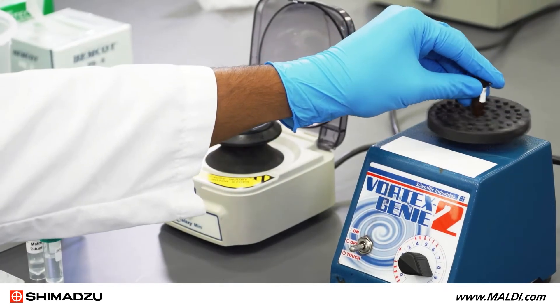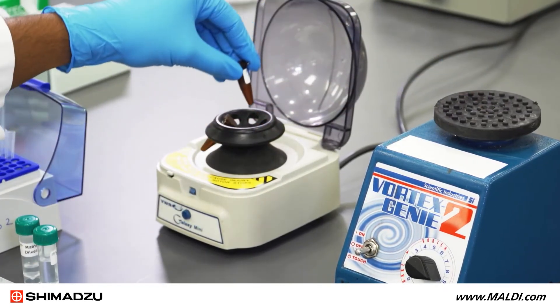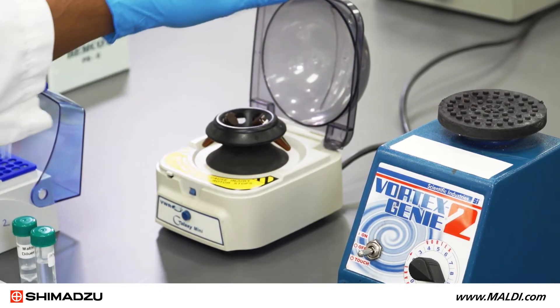Vortex the solution to mix the matrix, then centrifuge to ensure any undissolved matrix particles are not accidentally pipetted during the next steps.